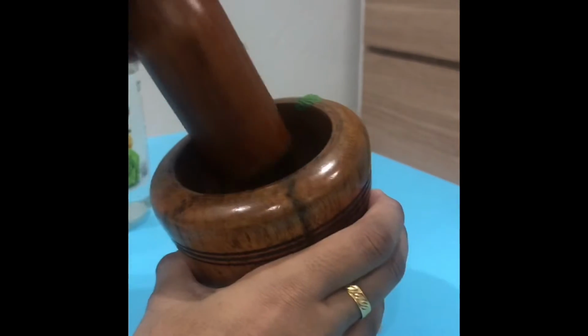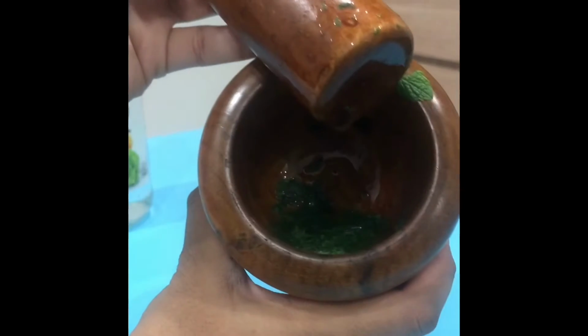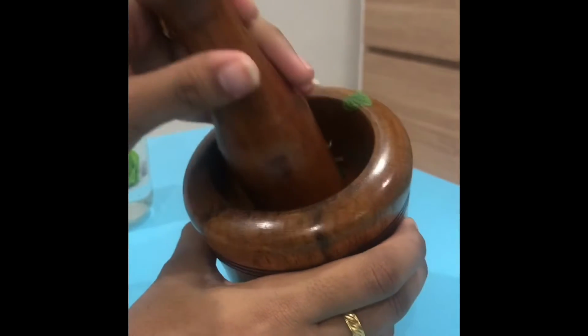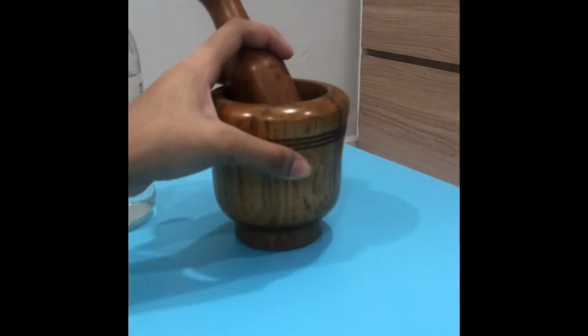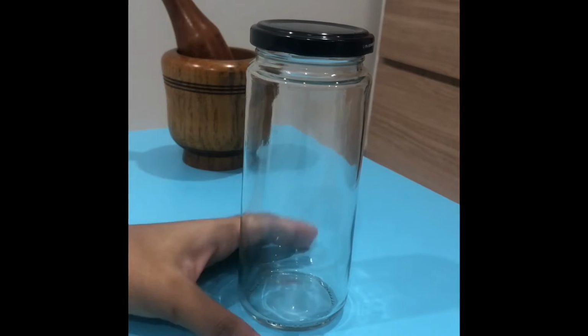It's been some time since I finished crushing the sample, so right now the sample looks slightly green and a little watery. Now we will move on to task 2. Task 2 would be to prepare the developing chamber.